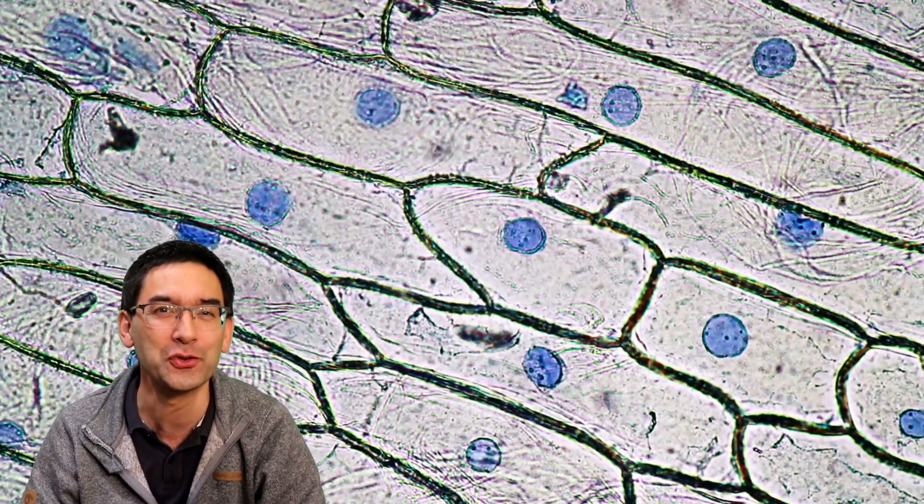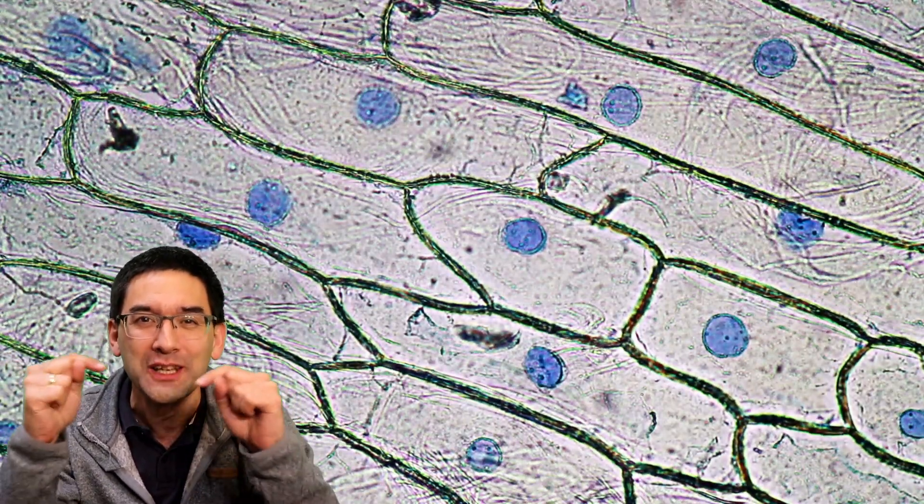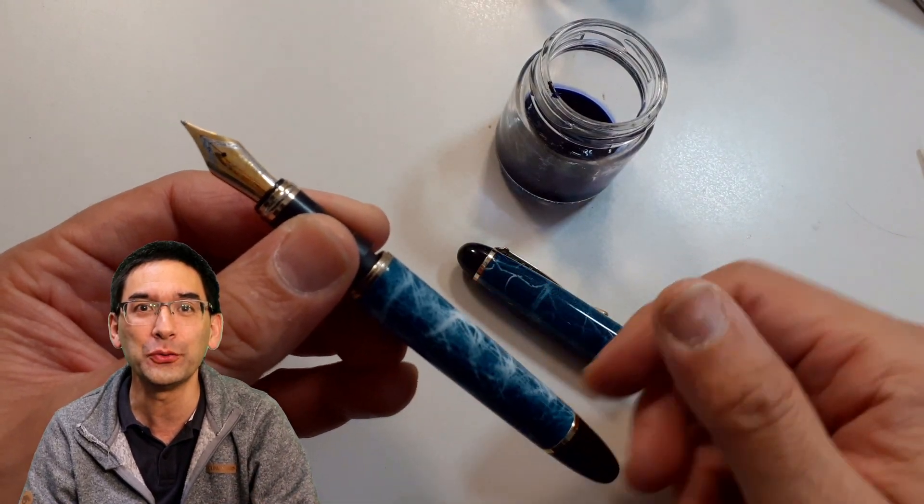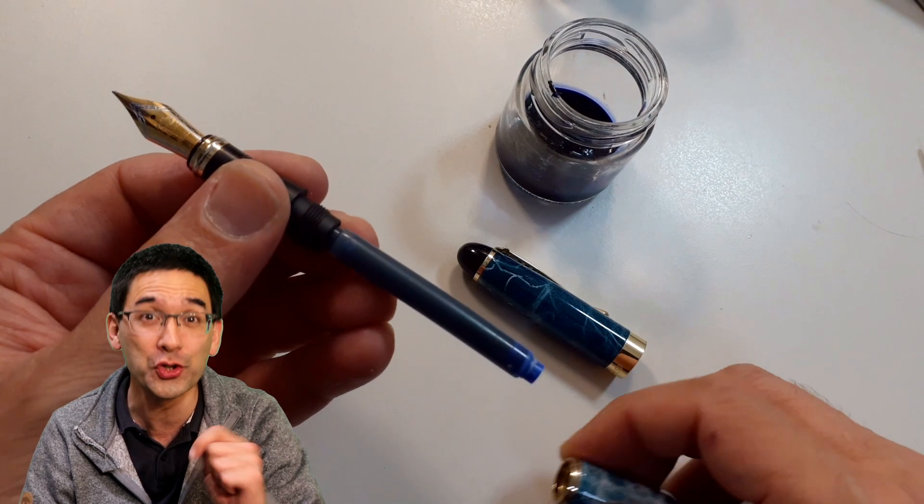There's a little trick that you have to use to make sure that the ink actually goes into the cells. We'll be using ink — regular fountain pen ink that is water-soluble.